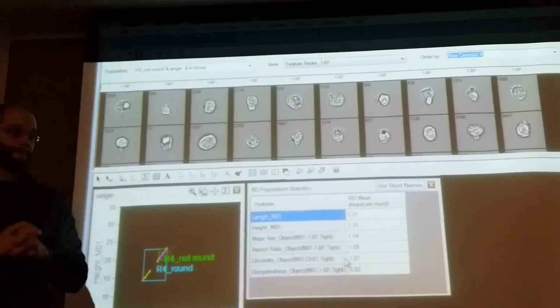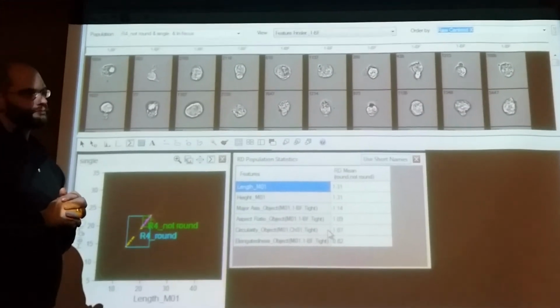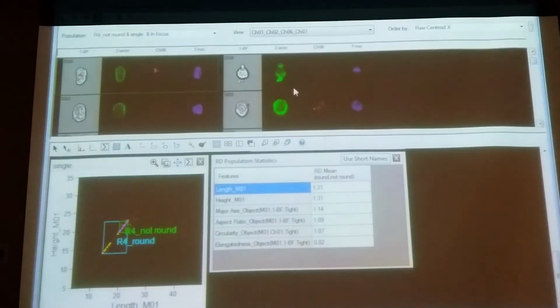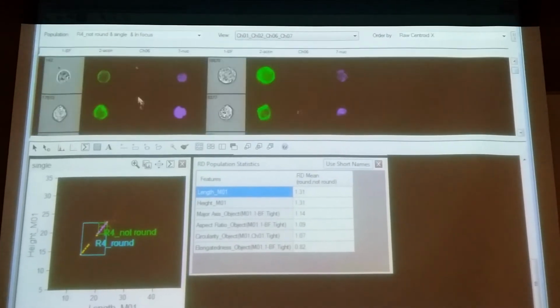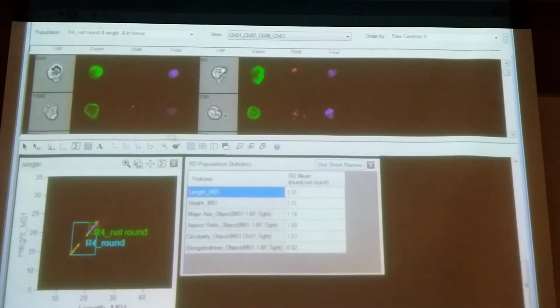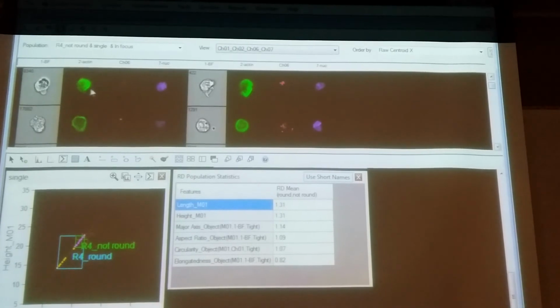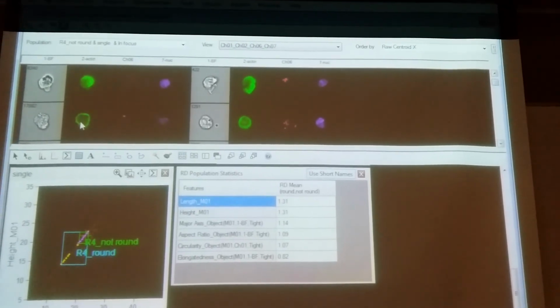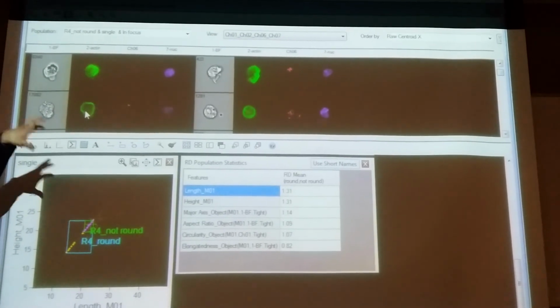So should we maybe have just tagged on the fluorescence channel or something to go along with the bright field? Because this was just on bright field. These channels, you see some are polarized and some are not. Oh, yeah. And so if I start using actin, this is going to be polarized, this one's not polarized. And so I could use this exact same feature finder to go through and tag polarized cells versus not polarized cells, do a comparison between those two, and it's then going to pull out a feature that's going to separate out polarized versus not polarized.